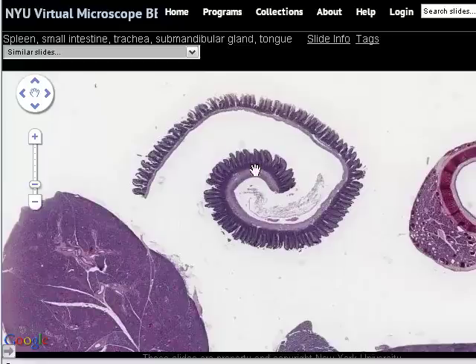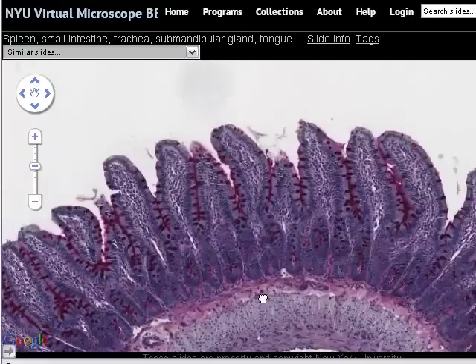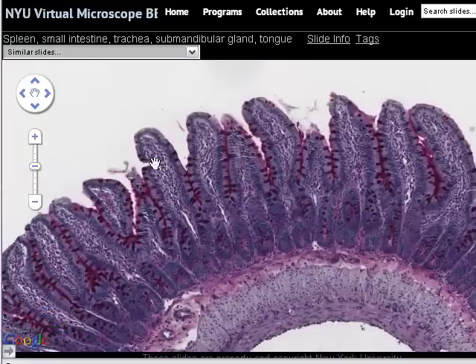This is a longitudinal section — a strip of gut taken out of the wall — and it's just been folded up here for convenience to fit it on the slide. Now we're going to zoom in and look at this region of the specimen.